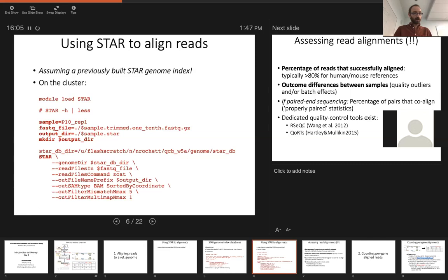Okay, so that's it for STAR alignments. So you should be able to get these alignments to run for this one sample, and I think I've created a second, or you could try on all samples and kind of get an idea. Yeah, so I want everyone to work on this, and there is more later.